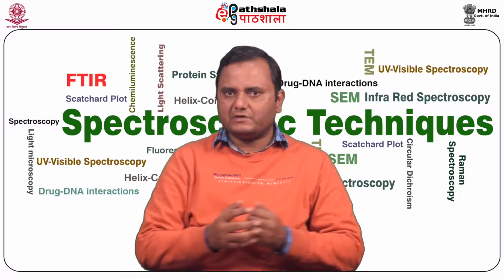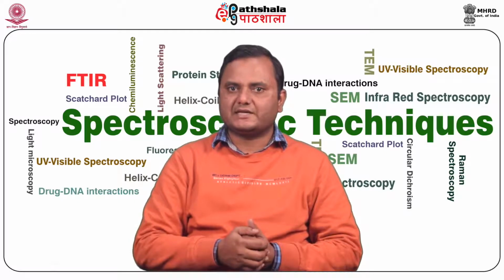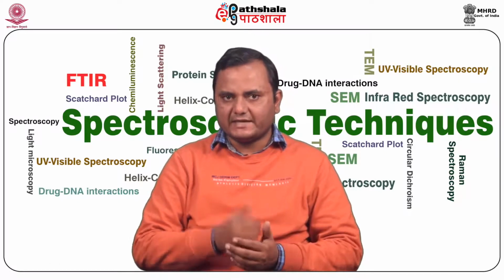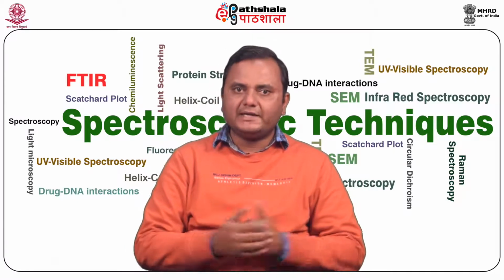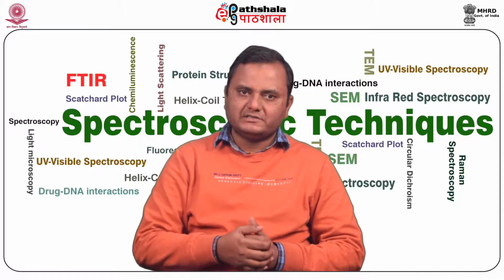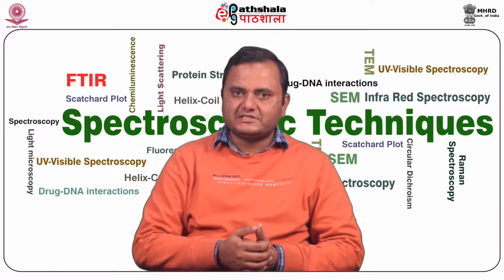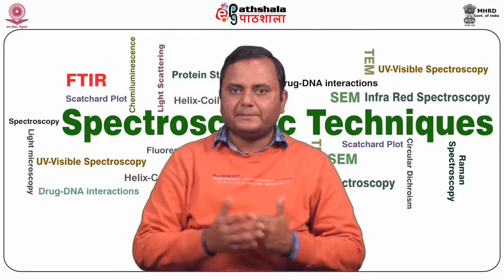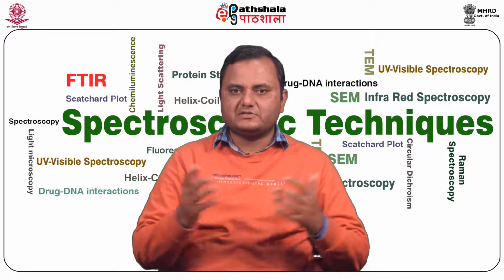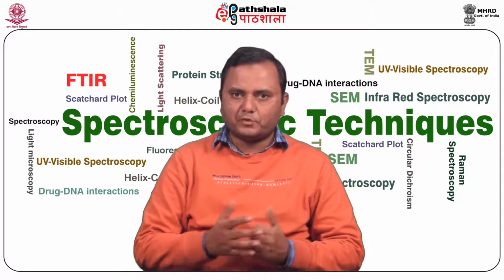These are the well-known online servers used to estimate the secondary structure content in a protein: SSE, known as secondary structure estimation, CONTIN, SELCON, CDSSTR, then self-consistent, LINCOMB or CCA, then BPN, which is based on the neural network method, SOM-BPN, and PROT-CD.